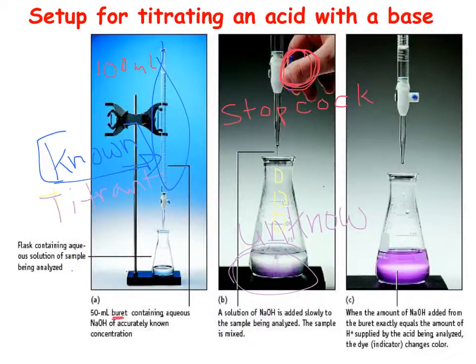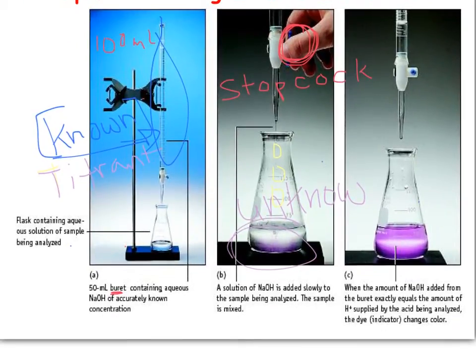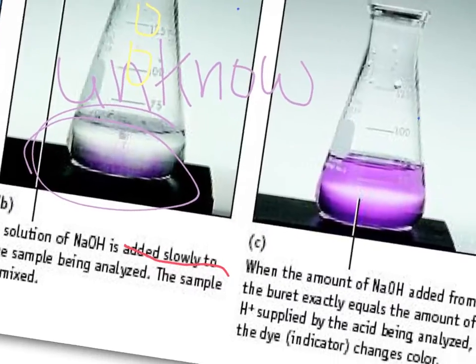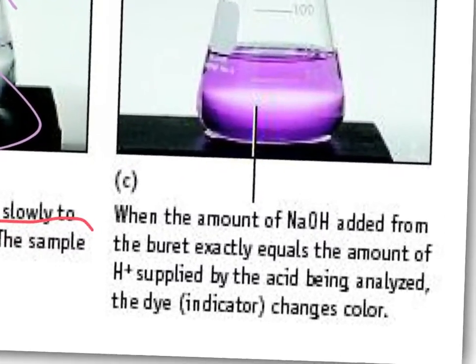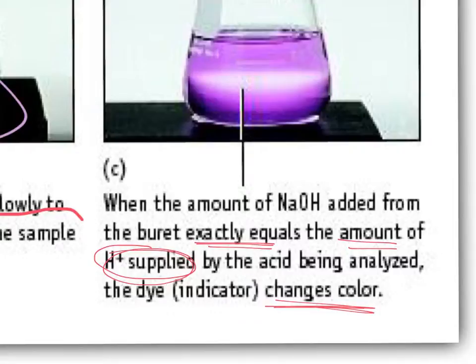And C, when the amount of NaOH added from the burette exactly equals the amount of H plus supplied, there is a color change.